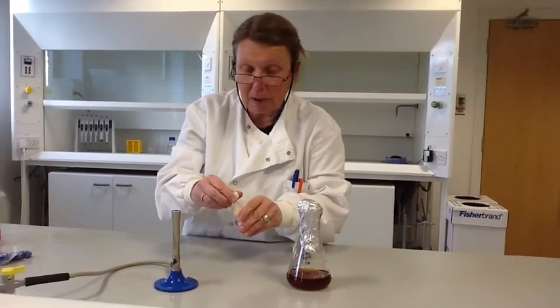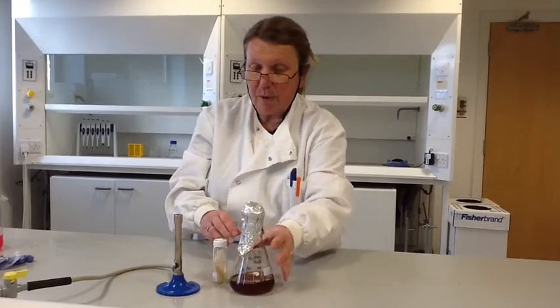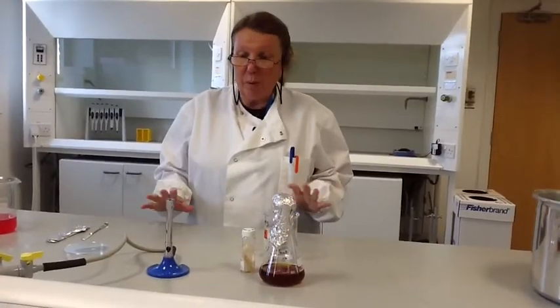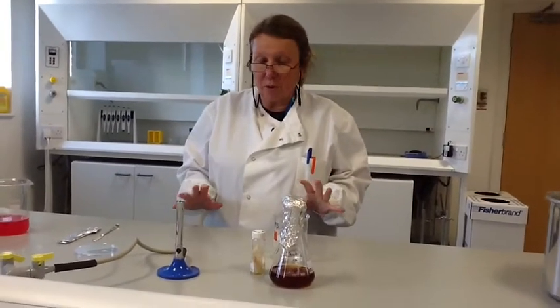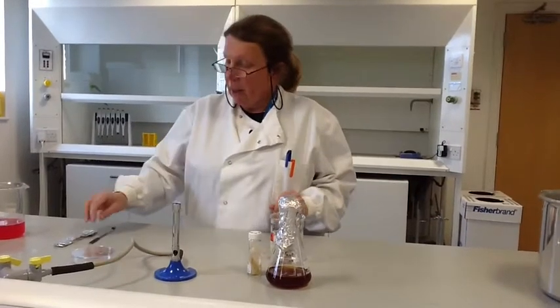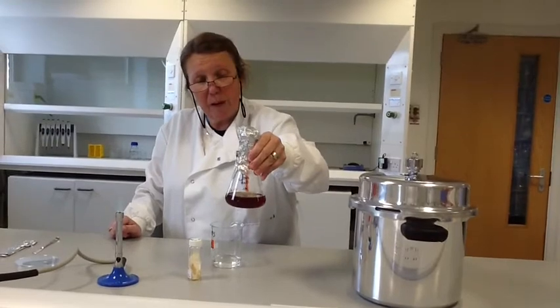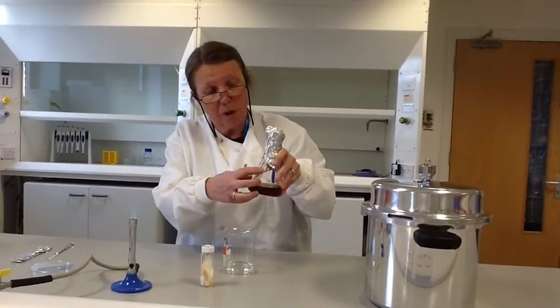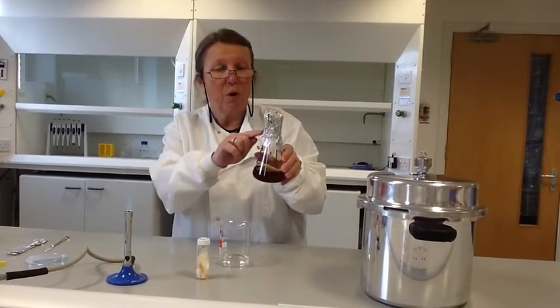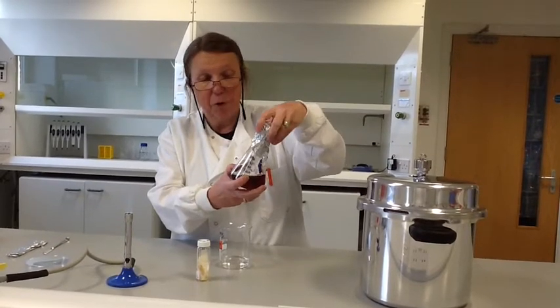If we loosen the cap slightly and get our culture nice and close to the Bunsen burner so it's within our sterile area — it's important when doing microbiology that all materials we're using are sterile before we start. Here we've got some malt extract media that we've prepared, with tape showing it's been autoclaved and is sterile. We've got a foam bung in here — you can use cotton wool if needed — and then foil on the top.